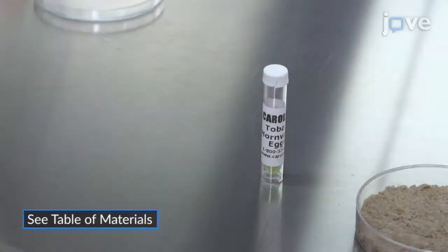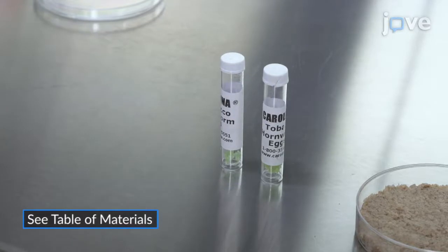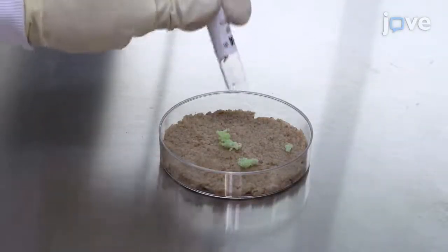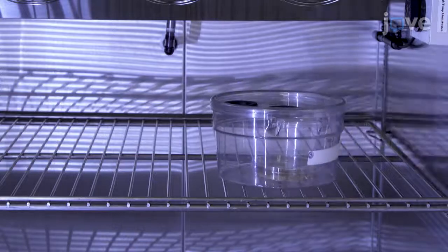Obtain 150 to 200 viable M. sexta eggs in wheat germ-based artificial diets. Place the hornworm eggs in a polystyrene Petri dish with a wheat germ-based artificial diet layer and transfer the eggs to an insect rearing chamber maintained at 25 degrees Celsius with 40 to 60% relative humidity.